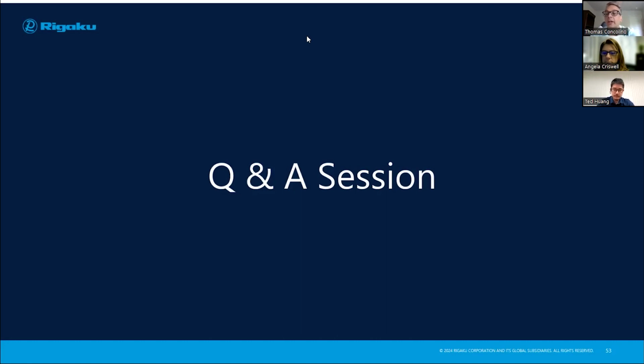Okay, thank you. I think this will be the last question we ask, and this is actually a pretty broad question, so go with what you feel is correct. What's the spatial resolution for CT? I think you saw the question come in. Of course, it depends. That's a really good question. In a way, yes, it's a variable, but there's still a ballpark.